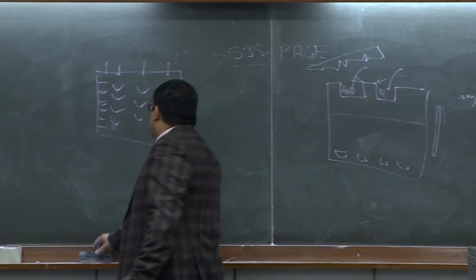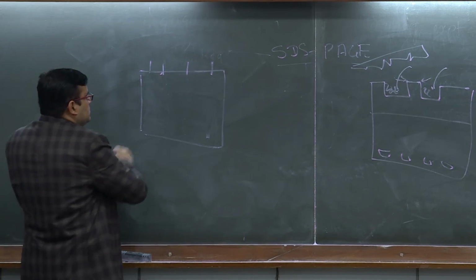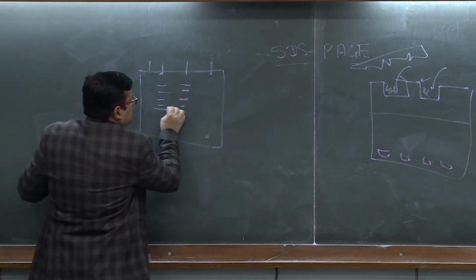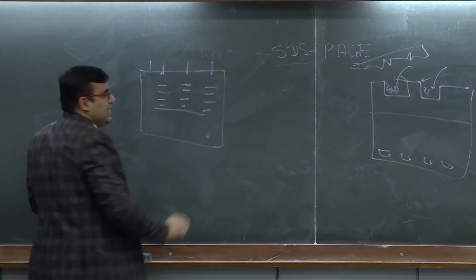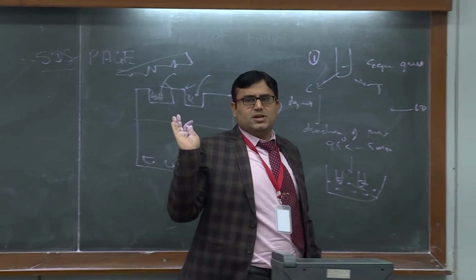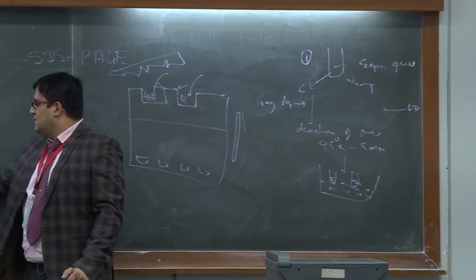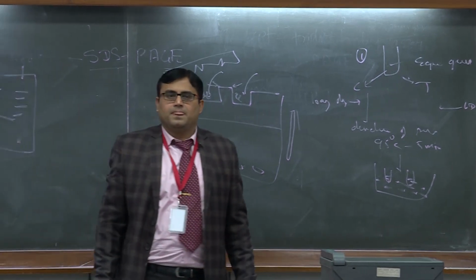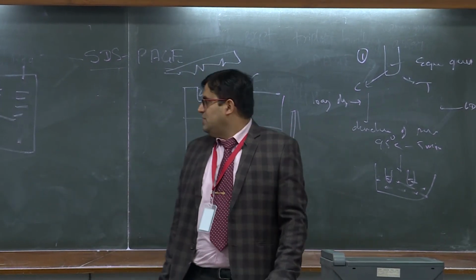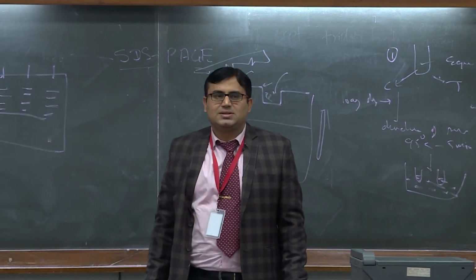Many times it happens that you will get a protein like this. Now upstairs a very beautiful band pattern is there, but there is a dragging and then nothing is at the bottom. What may be the reason? Loading error? No, if it were a loading error, then here you would not have got the protein bands.